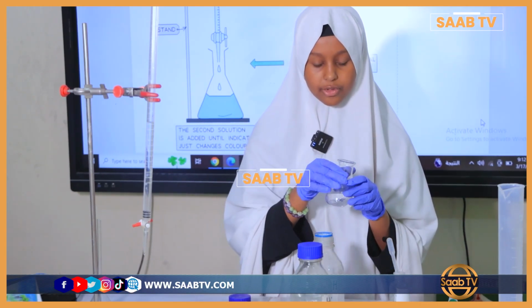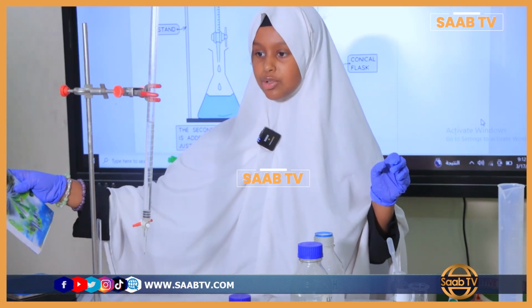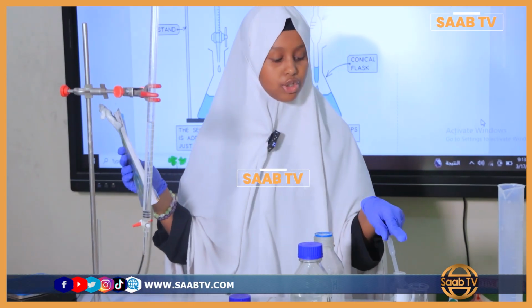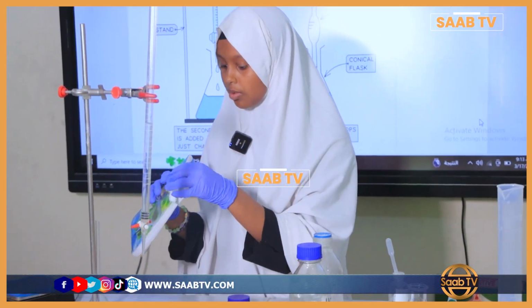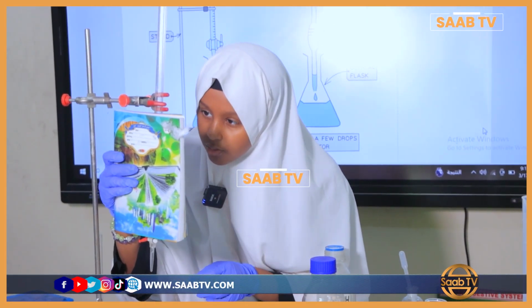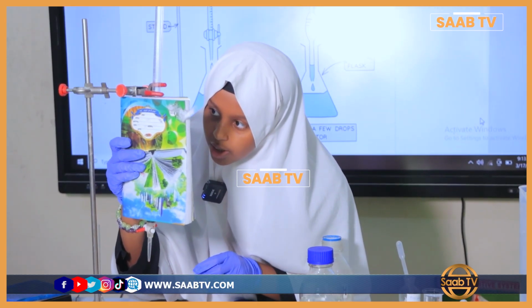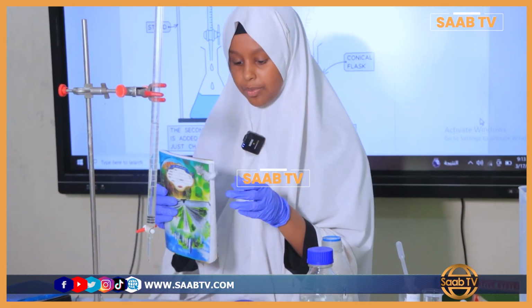So it's colorless now. Now we have to measure the amount of acid that was taken to neutralize the alkali with the burette. That is 39.1.